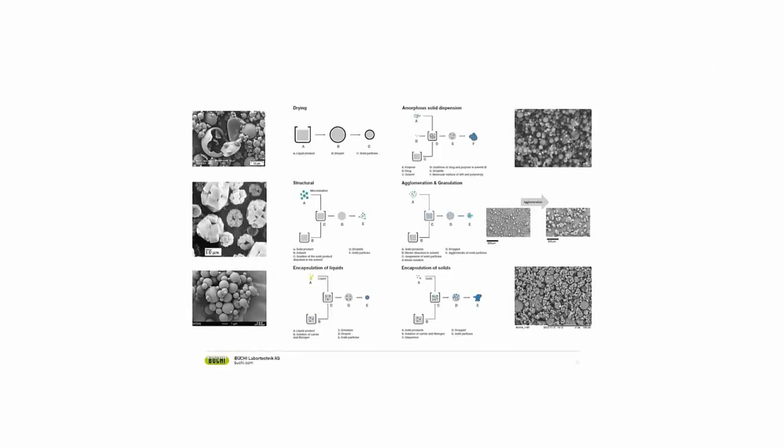So we can see that on this slide, we show all the types of applications that are possible with spray drying.